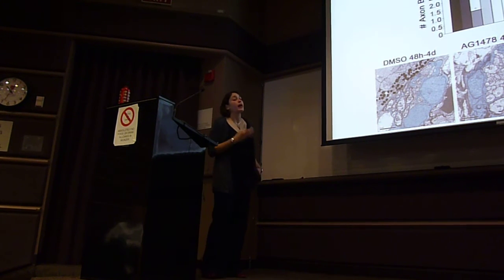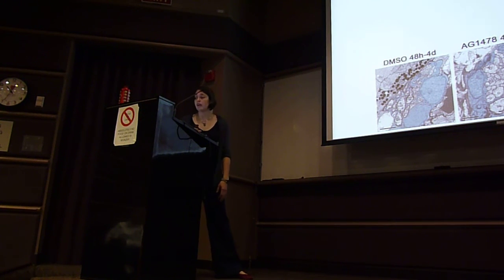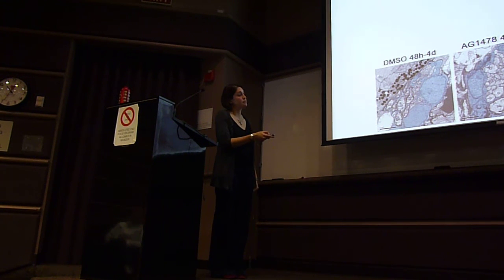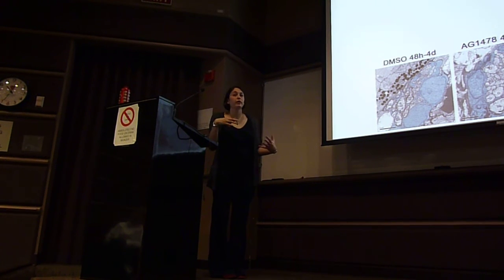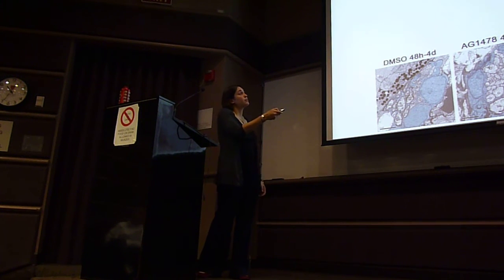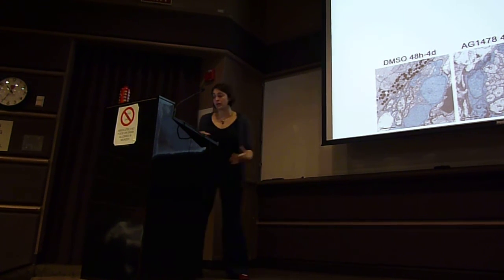We could quantify the number of axon bundles present within the nerve, so whenever a Schwann cell process enters a nerve, it bisects this cluster of unsorted axons. So here we've actually got 3 clusters of axons, but in the ErbB inhibited nerves, there was only ever 1. And finally, we could quantify the number of axons being touched by a Schwann cell. So whenever a Schwann cell inserts its cytoplasm into the axon bundle, it's able to interact with a lot more axons than when it's just located around the edge of an axon bundle. And so we saw a significant decrease in the number of axons being touched by a Schwann cell in the ErbB inhibited nerves, suggesting that there really is a significant process extension defect when we block ErbB signaling.